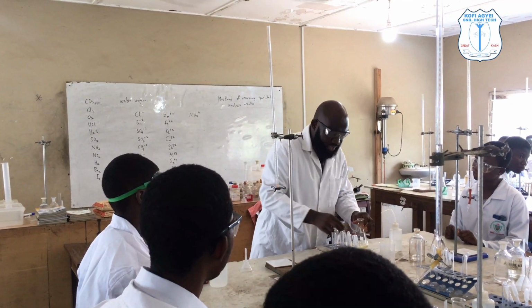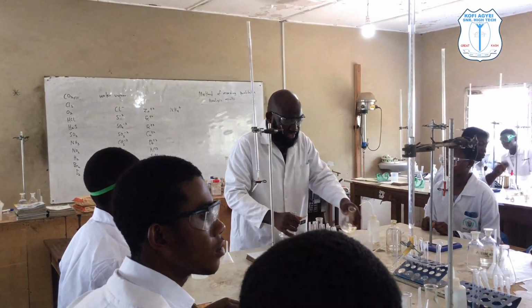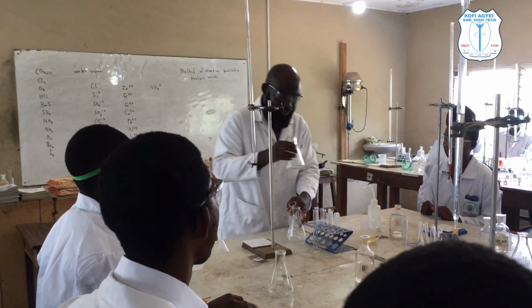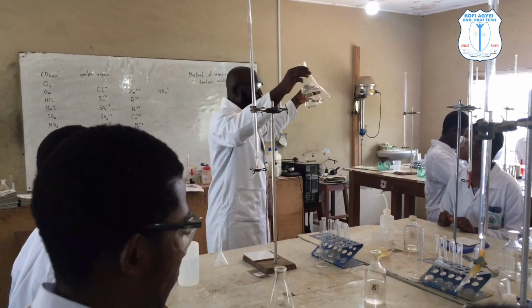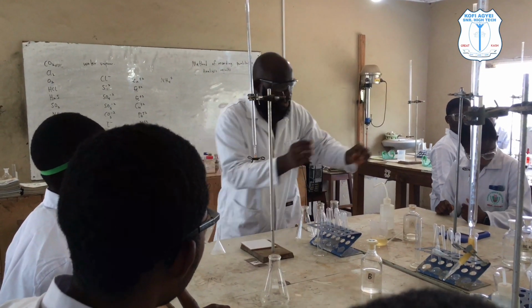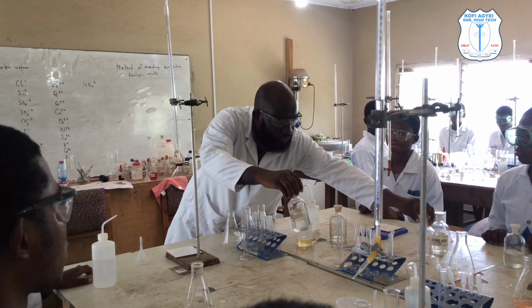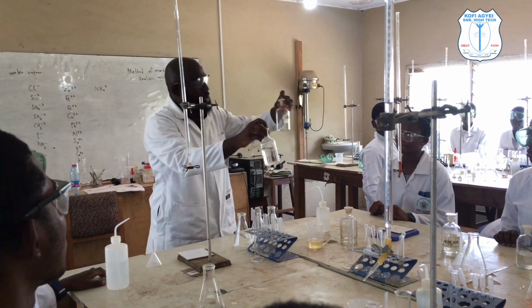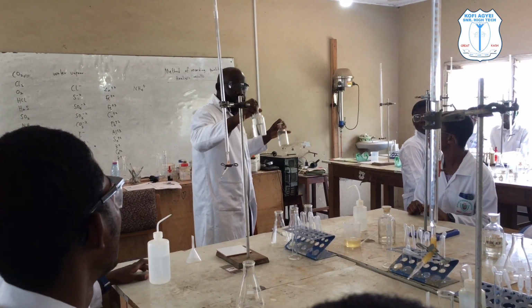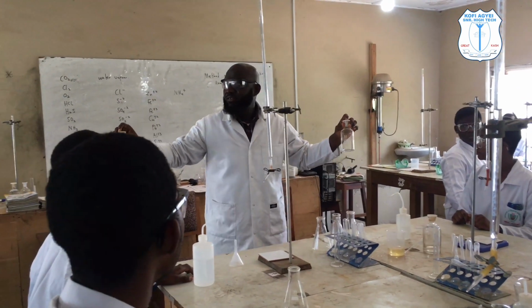Now in simple titration, you'll be given 3 conical flasks. So these are the conical flasks, and you are going to work with these ones. Now you'll be given reagent bottles. Have you seen the label? So this one is what? A. And this one is what? The B. So here we are basically set for the simple titration.